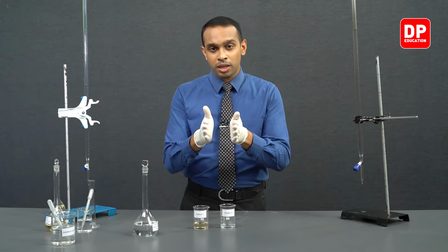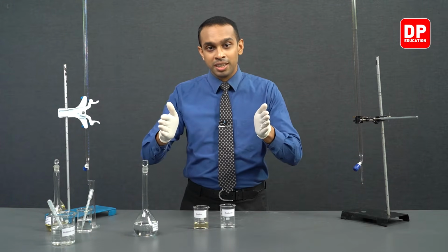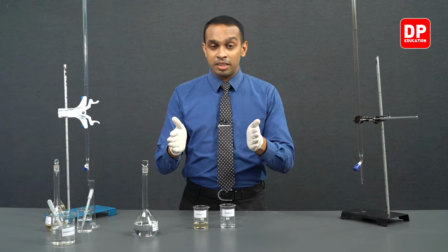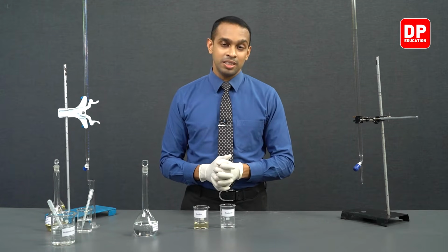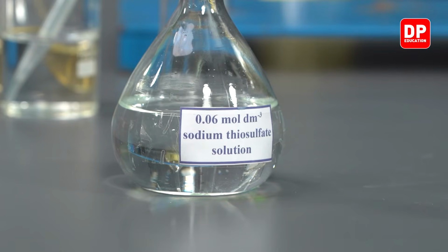Higher the concentration, higher the amount of sodium thiosulfate moles in the solution, which will lead to a greater delay after we add the solutions together. There will be a greater delay in displaying the color change. So this will allow us to measure a more clear time change. So we have increased the concentration to 0.06.